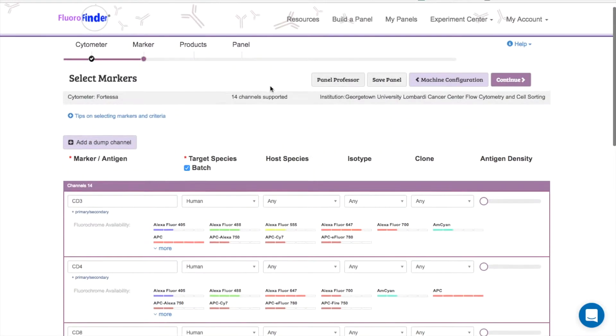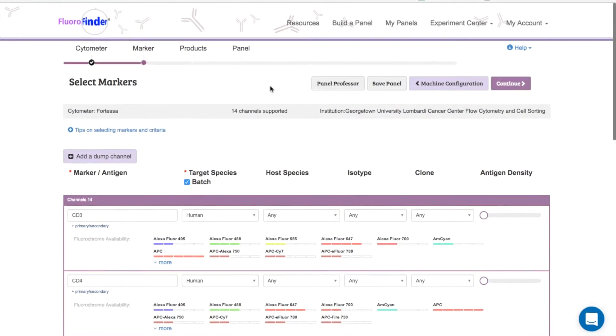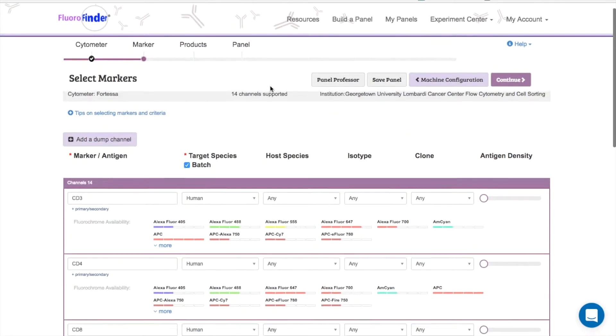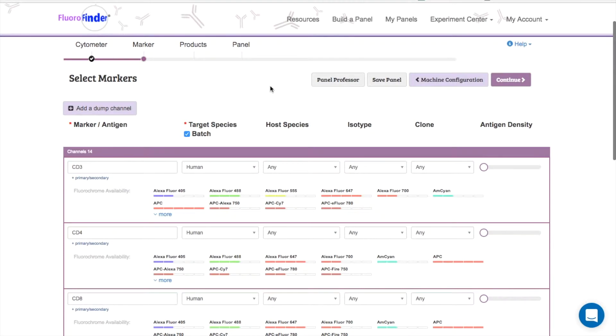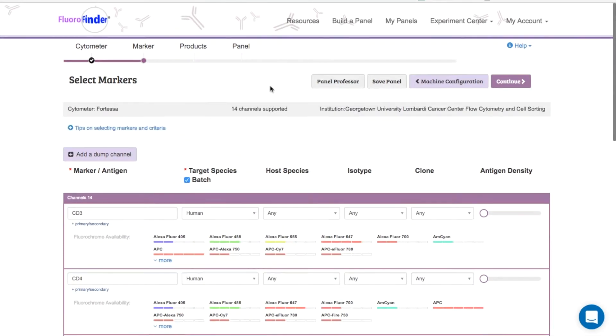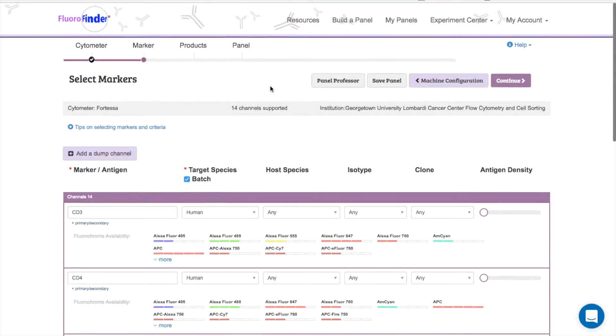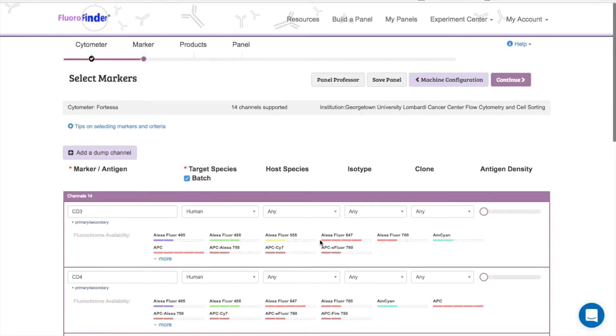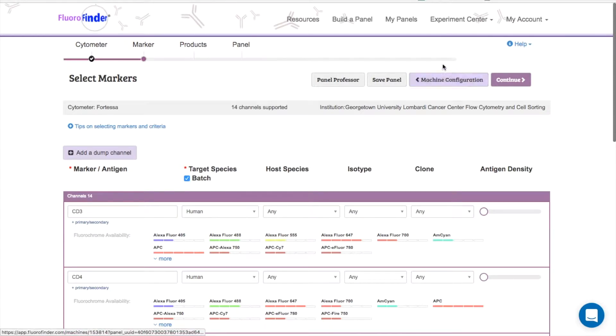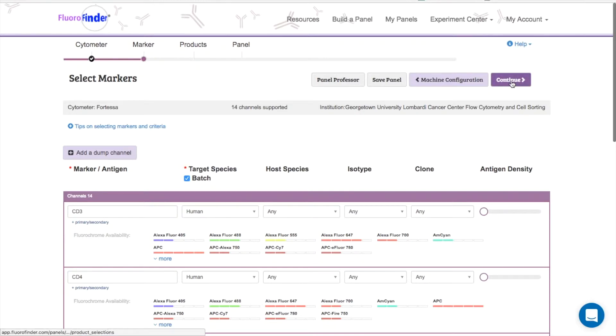When you first select your machine, Fluorofinder populates a default set of filter configurations that your core manager provided to us. If you know beforehand that your experiment will require a different filter setup, you can use this button to view the configuration and select from a provided list of swappable filters.